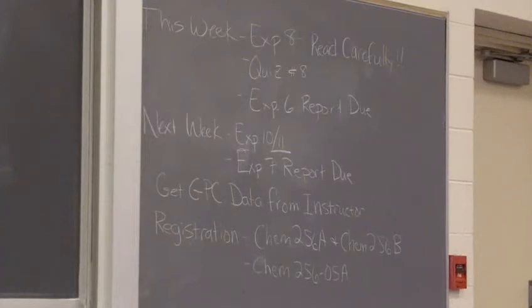Okay, first of all, before I read the other announcements, this is the IR spectrum that I posted on Moodle for polystyrene. It's the standard IR spectrum for polystyrene. Don't print it out. We don't need everybody to print out the same spectrum. Just use it for analyzing your IR spectrum, as well as the peak list there to include in your table, the IR table for the analysis of your polystyrene IR spectrum. But again, don't print that out, okay?